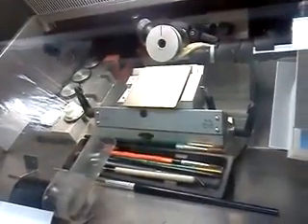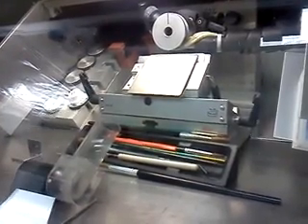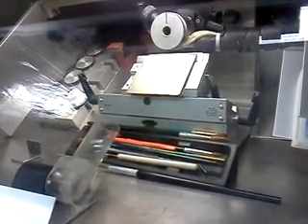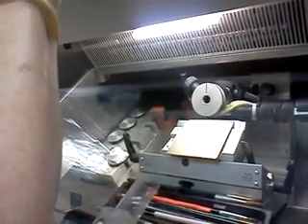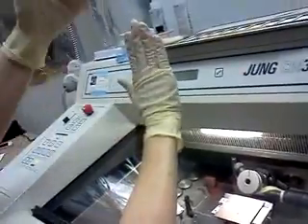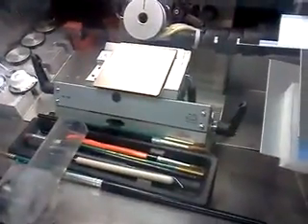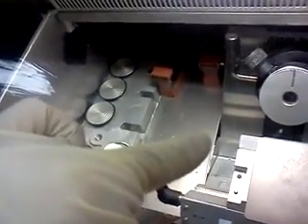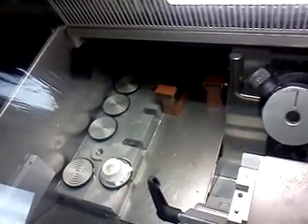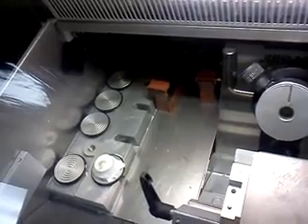What I was telling you about the olfactory, if you made it like this, you would have one level here and one level here. That'd be stupid. So you want yours like this. Now, by doing it this way, it just cuts it nicer than if you just went straight up and down. But that presents a problem because if you don't cut all your sections in one day and you come back, if you don't put that back in the same orientation, the top part will get cut and you're going to screw up all your tissue.